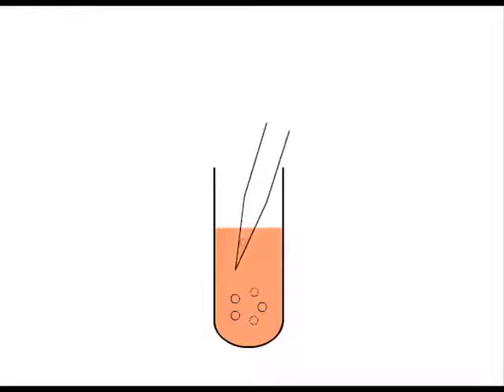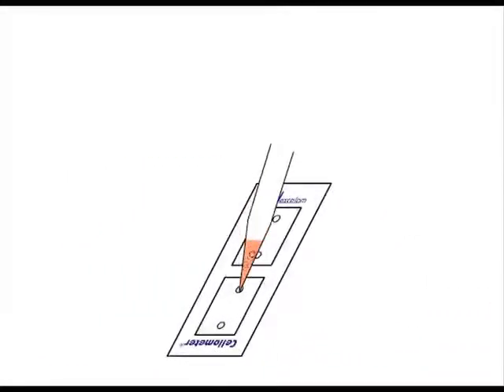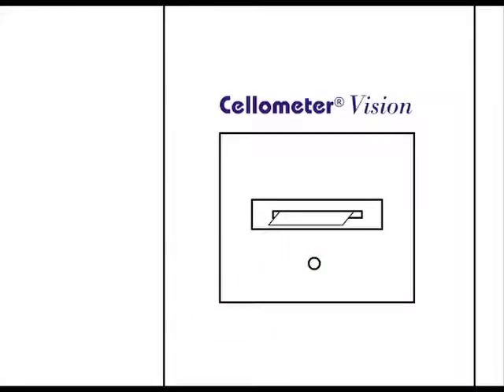To perform a cellometer Calcein-AM-PI assay, load stained cells into a counting chamber. Insert the chamber into cellometer.